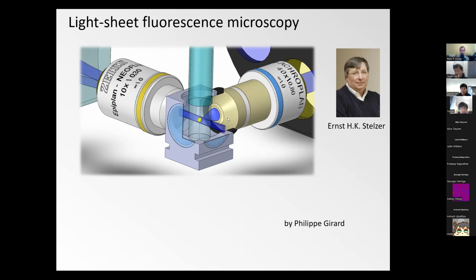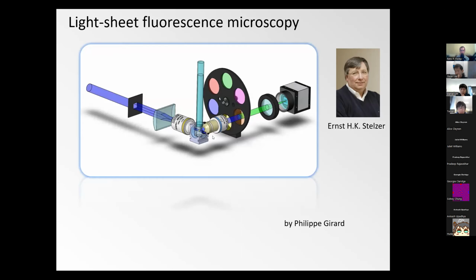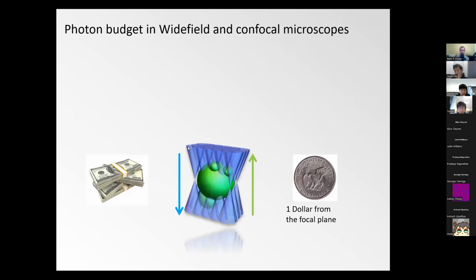So why would you build such a microscope instead of, say, using a confocal microscope? So here we can think of that the fluorescence photons we can squeeze out of a sample are finite. And for many people, it makes more sense if we think of that as a budget, as kind of money you have on the bank. So think of your bank account and say you have about $10,000 on it. And then the analogy of taking a single image was kind of, you make a withdrawal of say $1 and the bank charges you $100 commission.